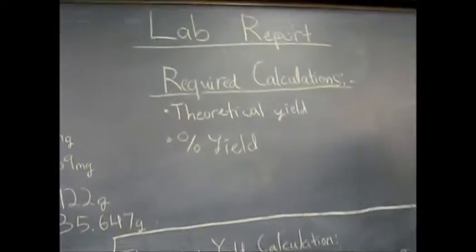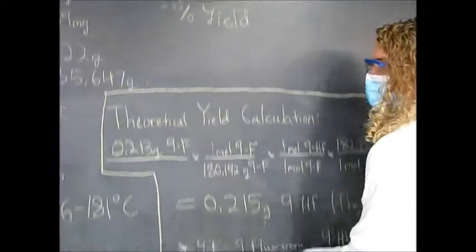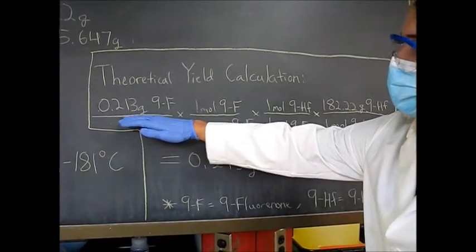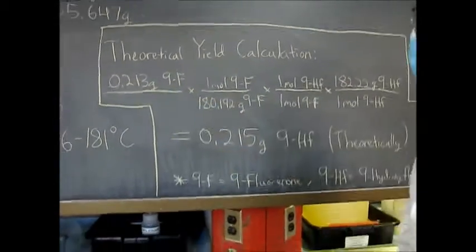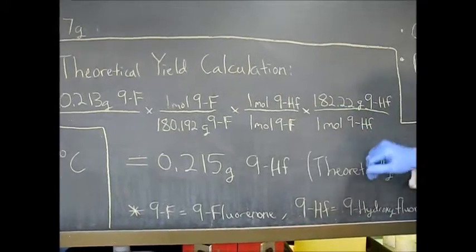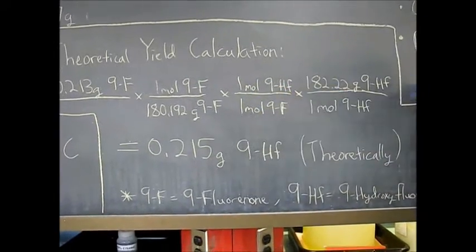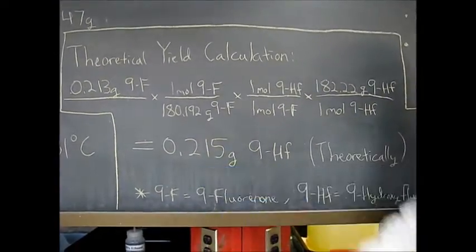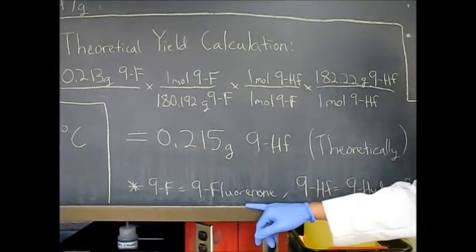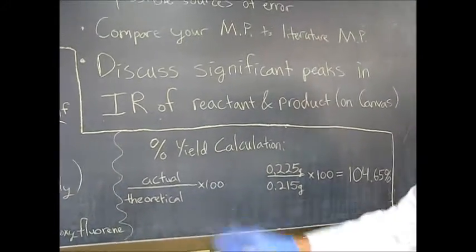The calculations that we need y'all to do here are just theoretical yield and percent yield. If you don't know how to do these, I've shown a little sample here. This will be different depending on what your data is. But for ours, we started with 213 milligrams of 9-fluorenone. You divide by the molecular weight of 9-fluorenone, then you get your mole conversion, and then you multiply by the molecular weight of 9-hydroxyfluorene. Whenever you do this multiplication and the division, you get 0.215 grams of 9-hydroxyfluorene. That's your theoretical yield. I just have 9F as 9-fluorenone, 9HF as 9-hydroxyfluorene.